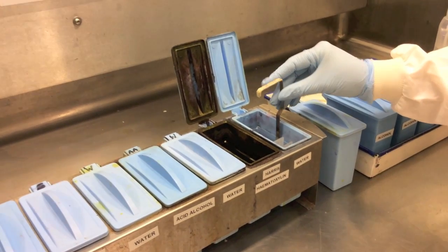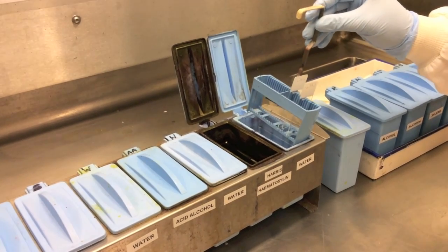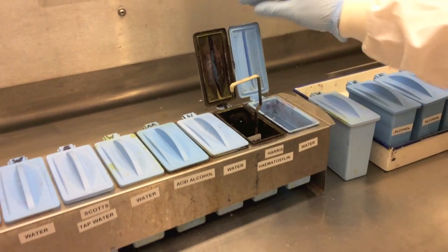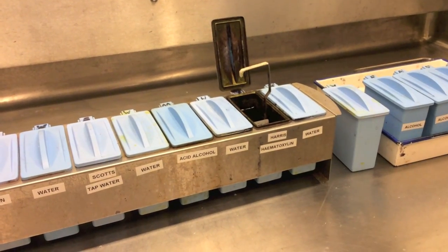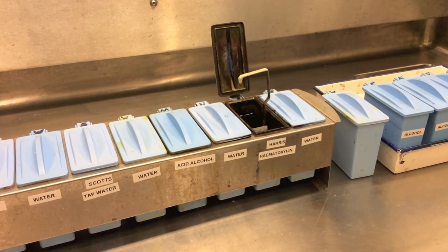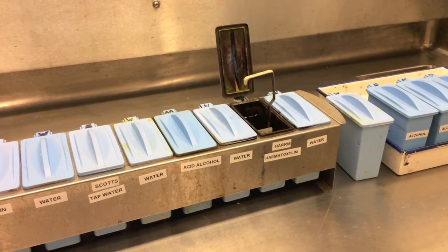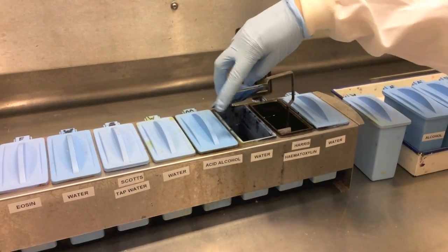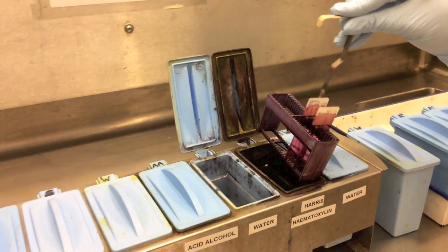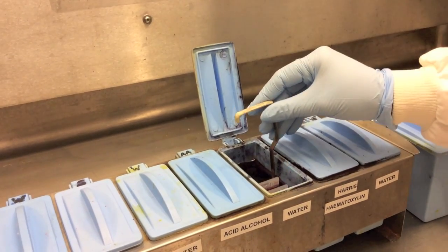The slides are then immersed in a staining solution so that you can see the tissue, because otherwise it's transparent because it's so thin. We used two stains in our interview with Professor Hupscher, hematoxylin and eosin, which is very widely used, and here the hematoxylin stains the nuclei blue, whereas the eosin stains the cellular cytoplasm a sort of pinky orange. And we also used a Van Gieson stain, and this is a differential stain for collagen, where the cells will appear a brownish yellow with a blackish nucleus, and the collagen is a very bright pinky red. The method is the same, you just use different baths, as you can see in the video here, to dip the cells into for the two different stains.